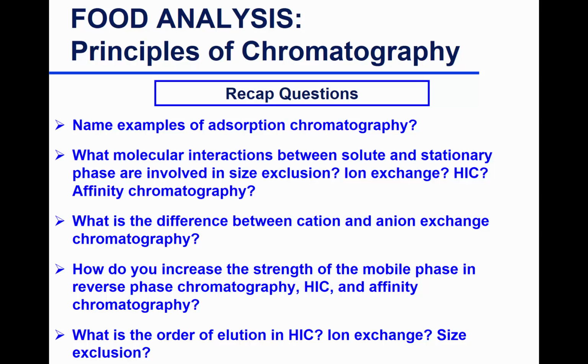She's very nice and sweet. But in order for cation exchange to occur, you have to have negatively charged molecules on the stationary phase. So in cation exchange chromatography, you're exchanging cations, so your stationary phase has anions on it. And the opposite is true for anions. So you're exchanging ions that are negatively charged, and your stationary phase would have a positive charge.